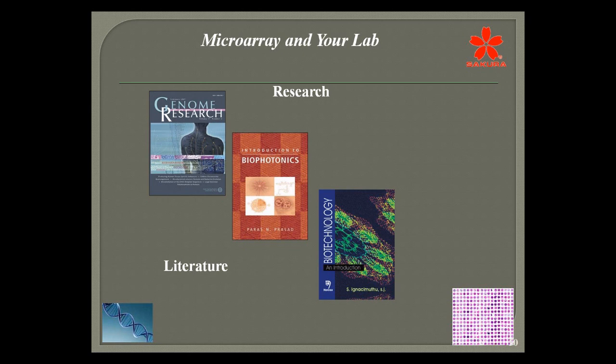There's lots of literature out there. It's a great tool today and a great resource. Any journal you pick up will practically have some method of an array block in it, whether it be a tissue microarray, or if you're into heavy research using a lot of molecular testing, you may see DNA arrays or arrays using other molecular tests.